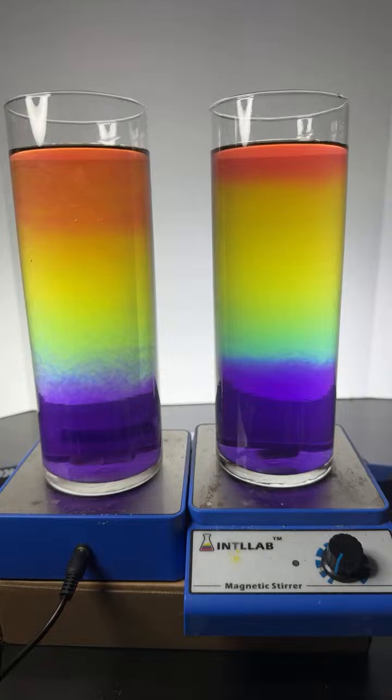So It's Me says, do they have different density? Apparently they do. They must. I don't know what's going on there, but every time I get this rainbow effect, the violet's on the bottom and the others on the top. What's all in there? Well, I guess hydroxide ion, maybe that's just more dense. I don't know. I really don't know.